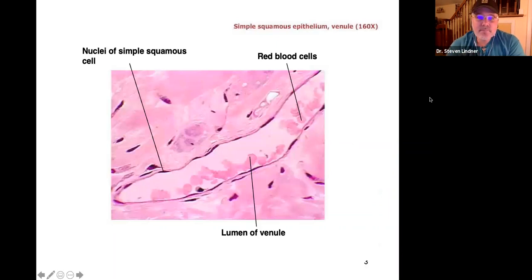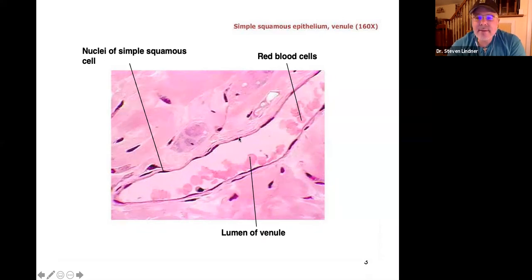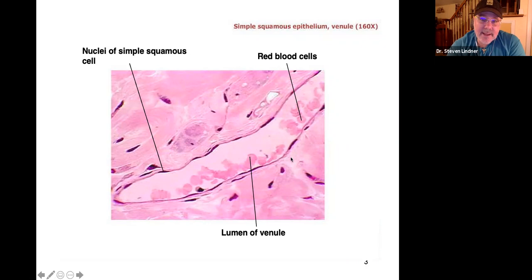When looking at a slide, you have to find the lumen — the hole. Then go to the layer that's next to the lumen, or the apical layer closest to the surface. Here we see red blood cells, which means this is the lumen of an artery or vein. Because the nucleus is visible and it's only one cell layer thick, this is simple squamous epithelium.